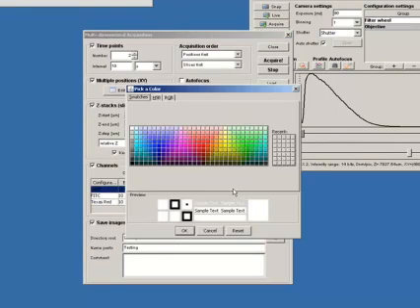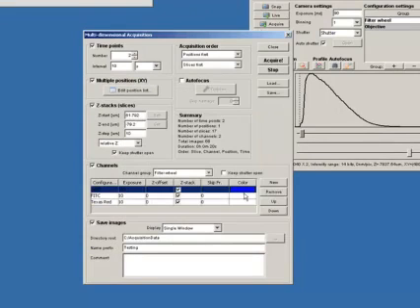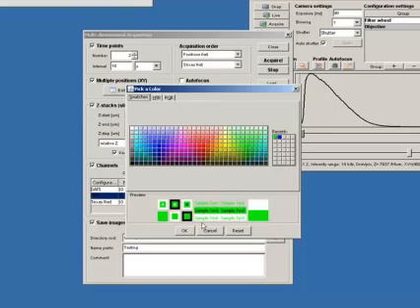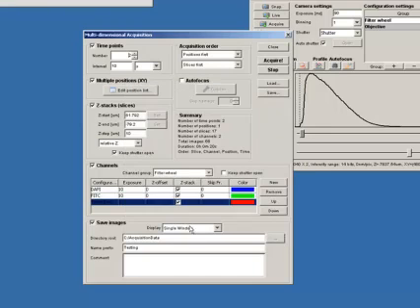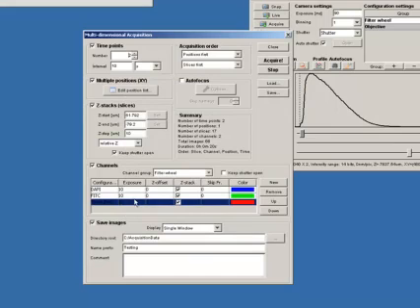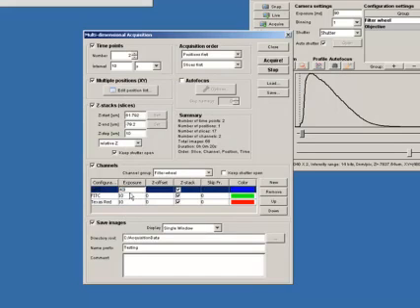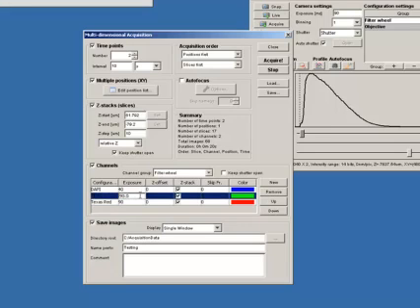You can also give it a color over here. So, this will mean that it tints the images. So, let's make that one blue for Dappy, let's tint the Fitzy images green. And the Texas Red image is red. We can also put an exposure time here. So, let's just change that slightly. And put in a 40 millisecond exposure for the Dappy. This is a nice bright sample I've got here. But, obviously the Dappy is brighter than the other channels. So, let's just put a slightly shorter exposure time for Dappy than the other two. So, that's fine.